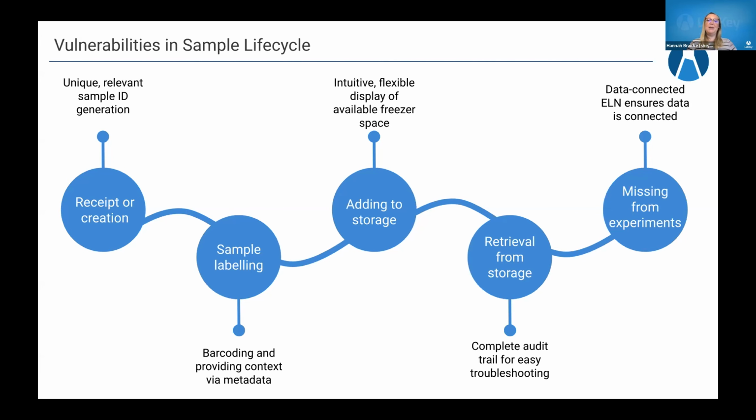Retrieving them from storage. So maybe somebody adds them into the lab. I think Dylan talked about attrition in that academic space. I've definitely experienced that, where a PhD candidate graduates and leaves, and we're left with an entire shelf of unmarked, unlabeled samples that we have no idea what to do with, but we're too afraid to discard them. So being able to go get those samples and know exactly where they are and what they are, and maybe potentially what they've been used for in the past is really important.